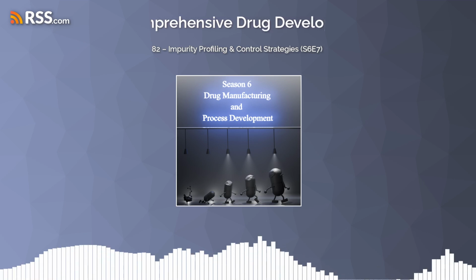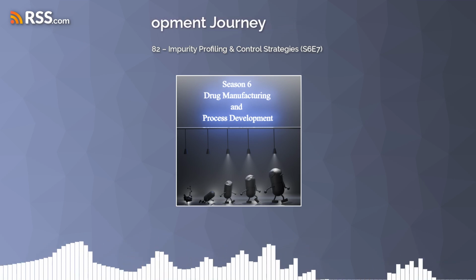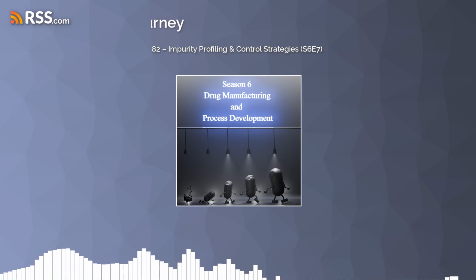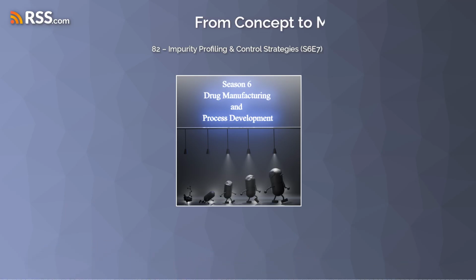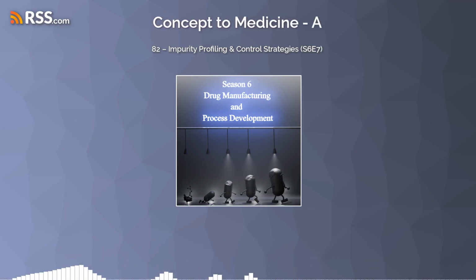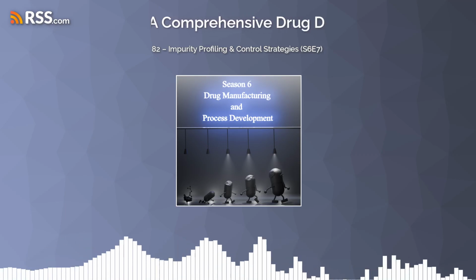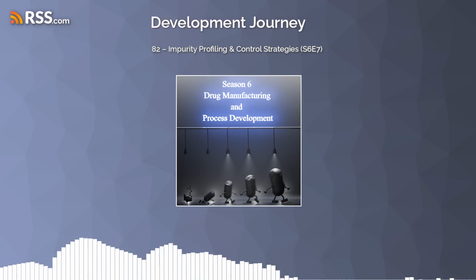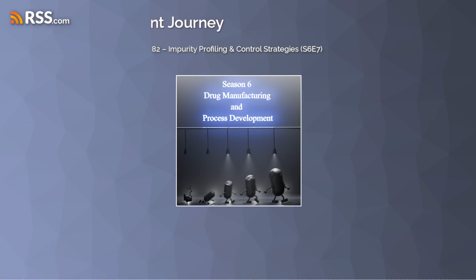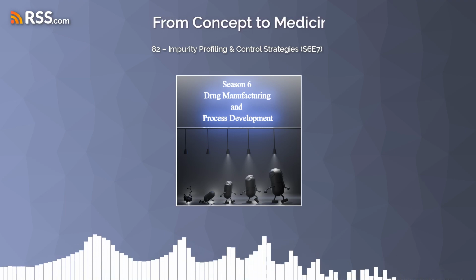Let's talk about them. Okay, so remember that enantiomeric purity upgrade we were talking about earlier, where they had that hemisalt forming and messing things up? Oh yeah, the one where they figured out the right solvent combo. That's the one. They didn't just stumble on that solution, it was systematic. They really dug deep into understanding the chemistry, the properties of the drug, and the impurity. And they even used NMR to confirm the structure of that hemisalt, which helped them figure out which solvents to use. It's a great example of how this isn't just trial and error, it's about using analytical thinking to guide the process.